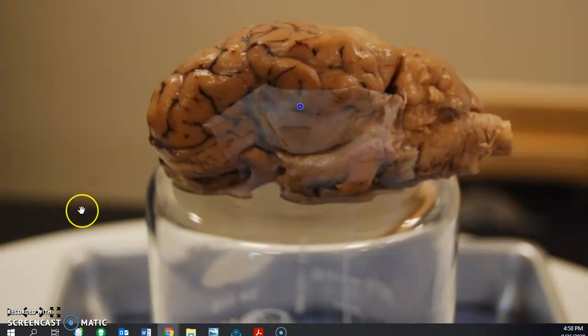So this is the brain. This is rostral. This is caudal. I can tell because that's the spinal cord right there. Now, this right here is the dura mater. And this thin film over the rest of the brain with the blood vessels is the pia mater. Now you notice that the dura mater is actually going between the cerebrum and the cerebellum. That's the cerebellum, everybody. You could even see the folia right there. And that is going to be the tentorium cerebelli.